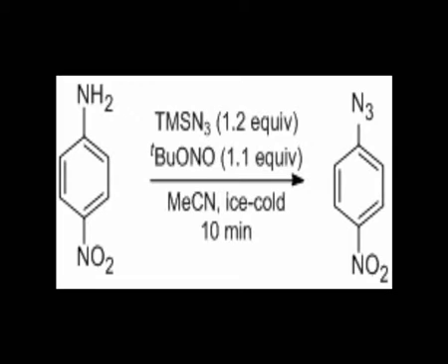This reaction is also the basis of the in situ generated azides used later in this course and in other videos.